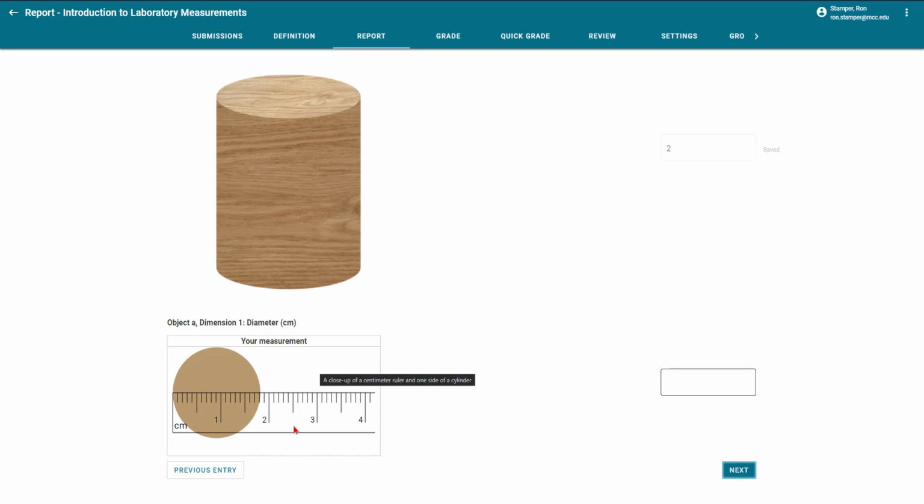So this is a measurement tool now. We've seen here that we have this ruler going across the diameter of the circle, so right through the center. Notice that it is already lined up for you precisely at the beginning, and then we go to the end. This is where measurement comes in handy, and if you had read through the PDF, you would see that anytime we're using an analog device like this, we need to measure what we can see and then estimate one additional decimal place. We do that anytime we're using an analog device.